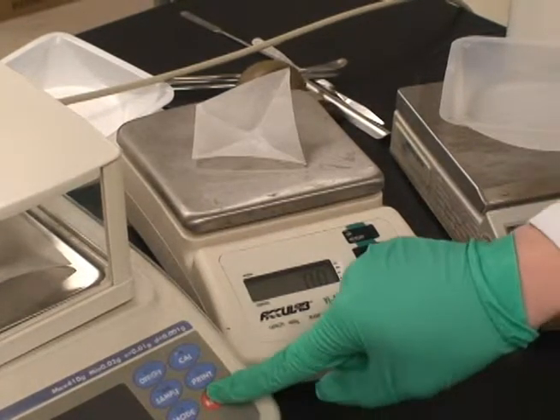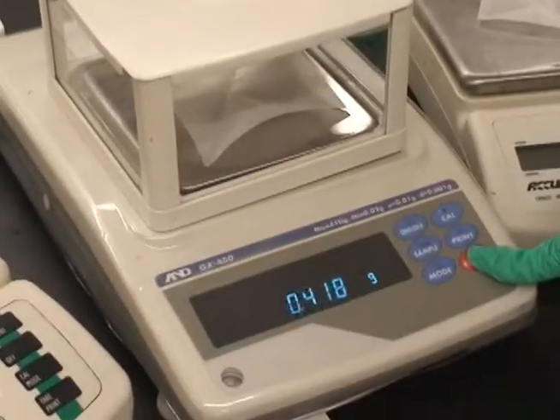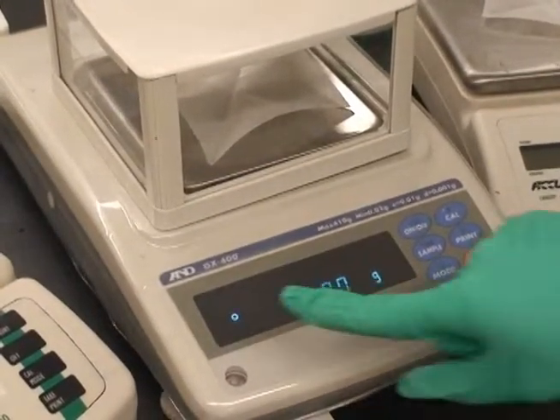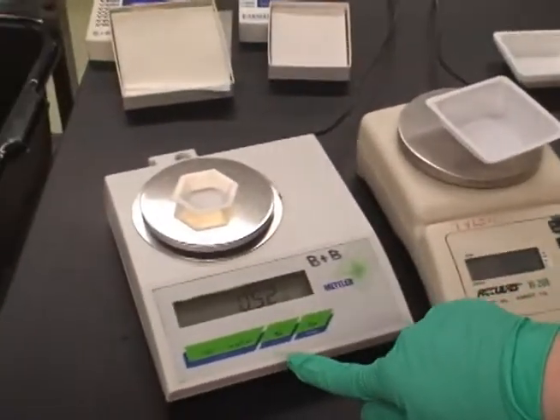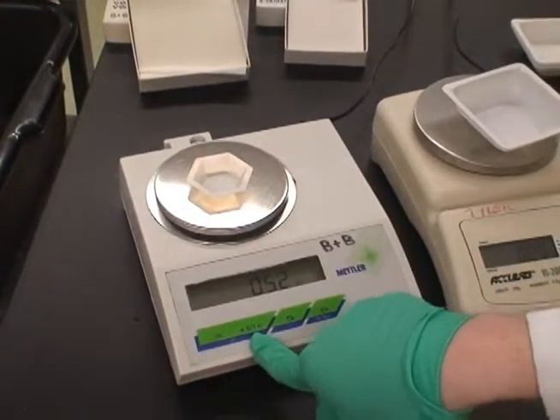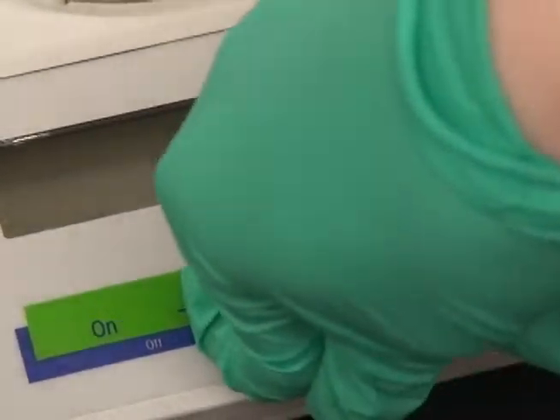One thing you'll probably notice is that even after the balance is zeroed out, the weight on the display may do a little shifting. This is because of the airflow of wherever you are. Shields can help with getting an accurate reading — just make sure you shut the panel. Balances with shields are often very air-sensitive.